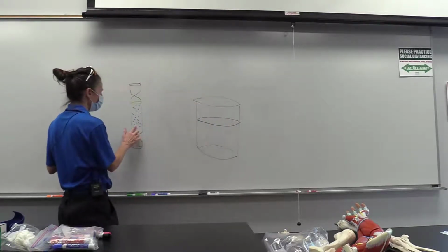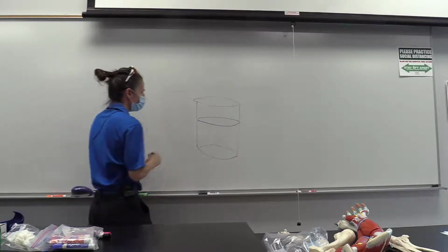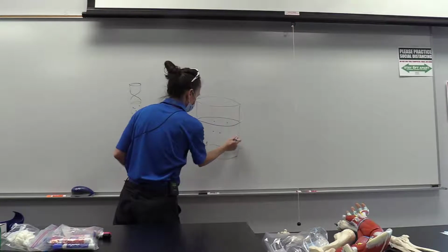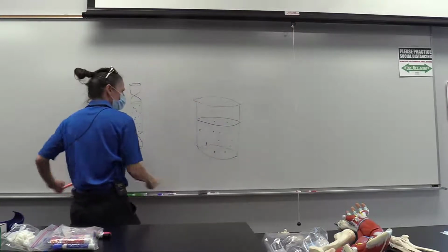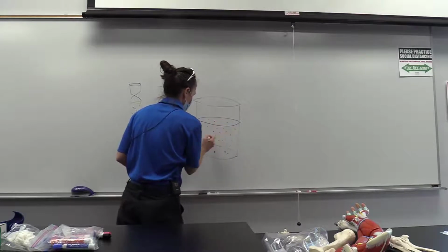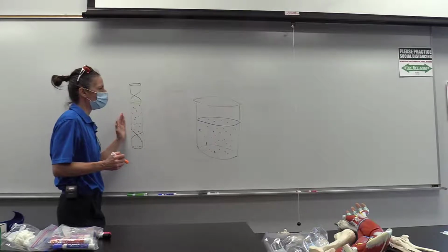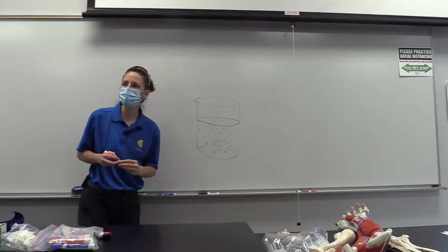Likewise, he did the reverse. He put the starch solution in the beaker, but left the bag just pure water. So we had the starch solution in the beaker, and I think he used a 40% starch solution. And then we put the bag, which is water, in the beaker. And so what happened after the hour?